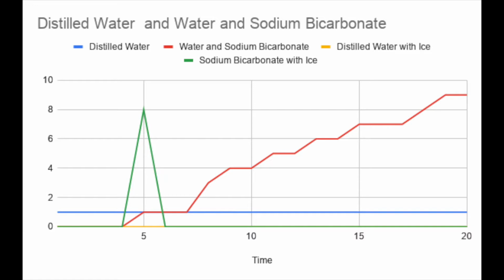Meanwhile, we had 9 discs float, and this group had 0. If the temperature was room temperature or warmer, more discs for this group would have floated.